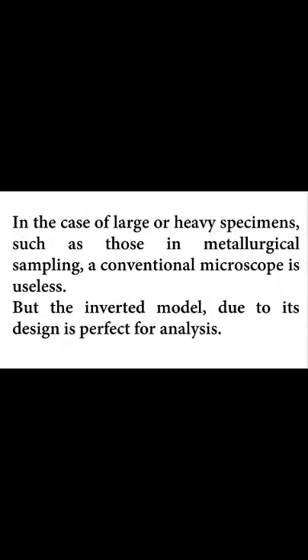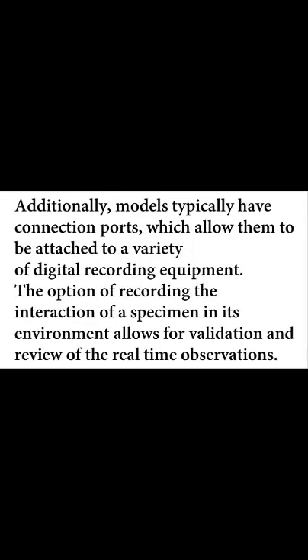In the case of large or heavy specimens such as those in metallurgical sampling, the conventional microscope is useless. But the inverted model, due to its design, is perfect for analysis. Additionally, models typically have connection ports which allow them to be attached to a variety of digital recording equipment. This option of recording the interaction of a specimen in its environment allows for validation and review of the real-time observations.